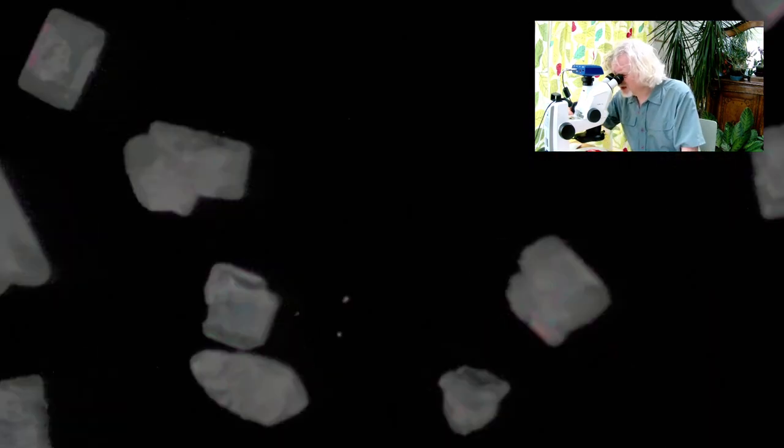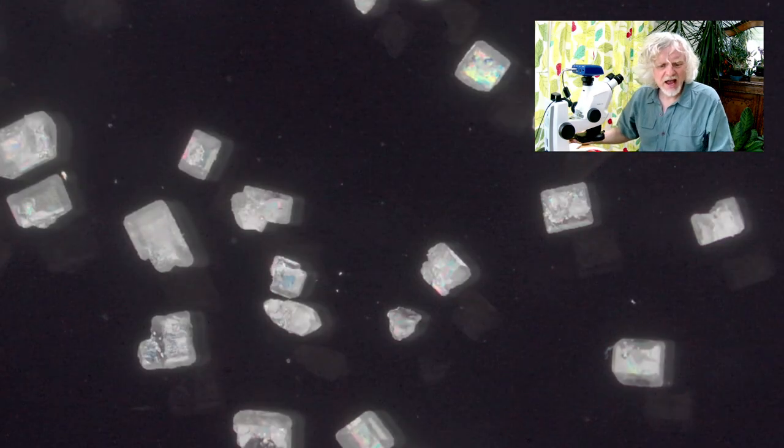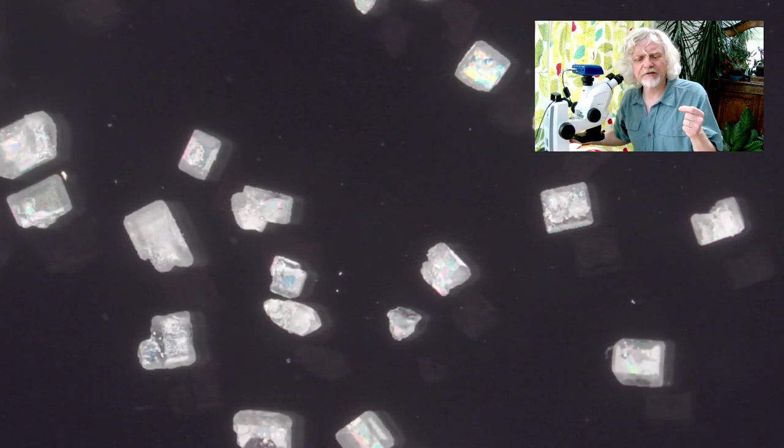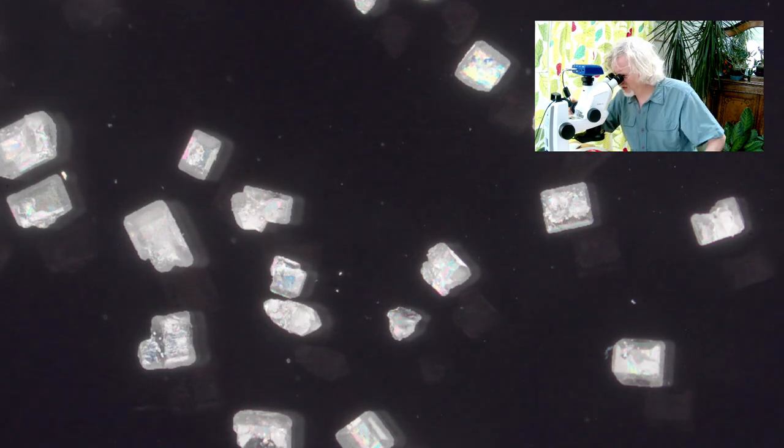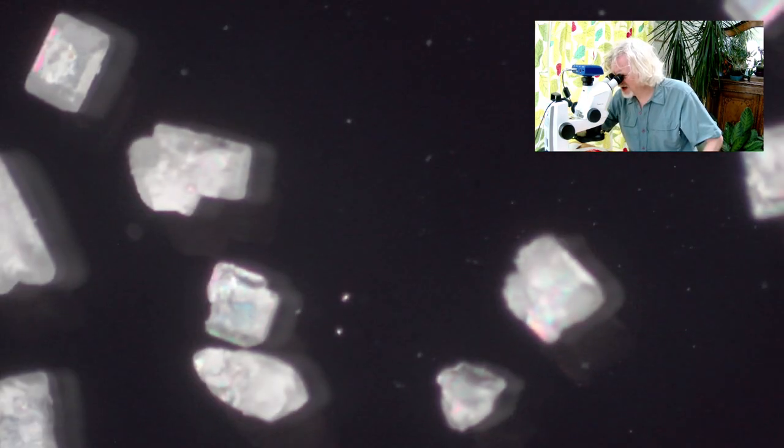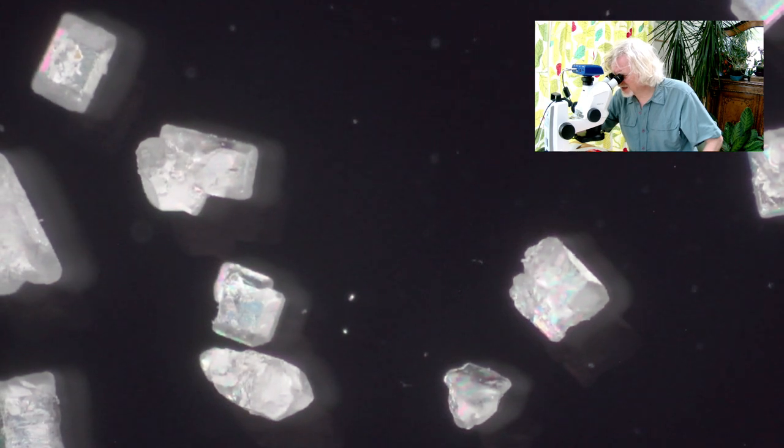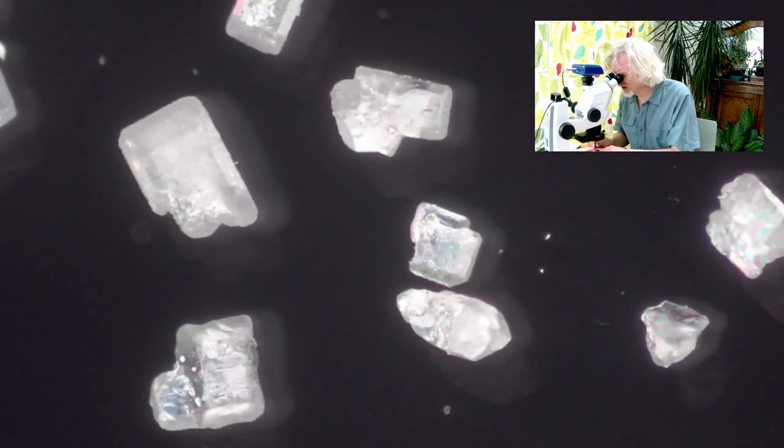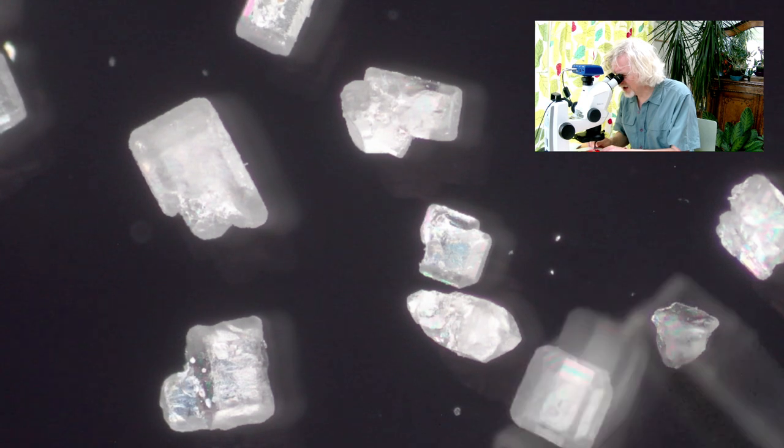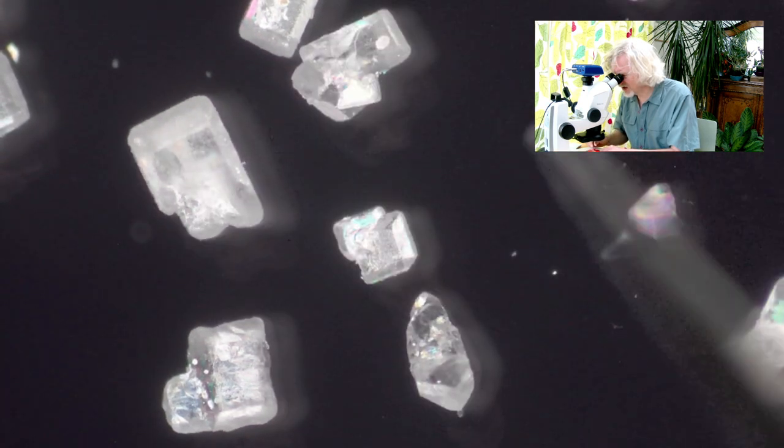And, well, it's similar, shall we say, except there are some subtle differences. First of all, it's quite a lot bigger. This is granulated sugar. Granulated sugar, you get the biggest crystals of anything you can buy. But, importantly, it's not perfect cubes. It's quite difficult to show because they tend not to end up on their sides. I'm going to try and do something that's probably foolhardy. I'm going to try and move a crystal about and try and turn it over.